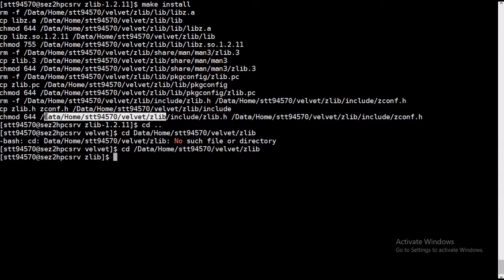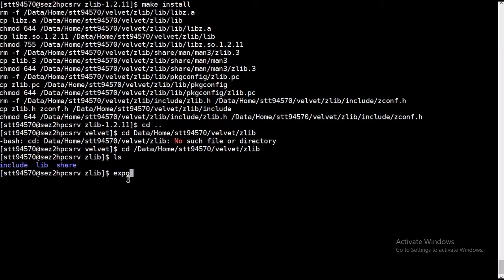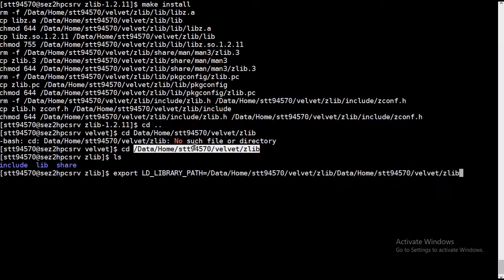So we need to export this before we proceed for installation of velvet. We will first export the LD_LIBRARY_PATH like this.